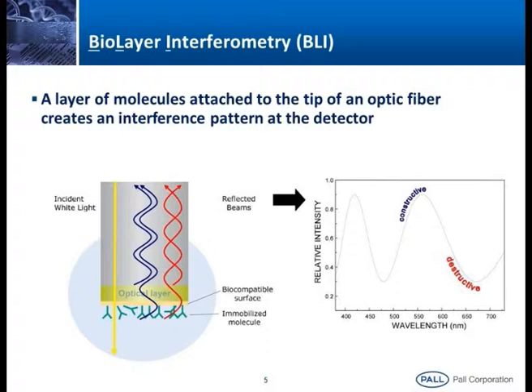Here, due to the biocompatible matrix, there is always a kind of block and some light gets reflected back. Only 5% of the light is reflected, and the rest, 95%, is transmitted into the well. One light goes through the ligand, which acts as an obstacle, and once again light gets reflected back.